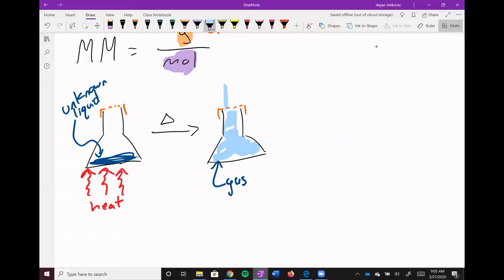And this gas at the beginning will be free to escape. Once there's a whole lot of it, it'll escape pretty quickly. But once the pressure inside of the vessel and the atmospheric pressure are approximately equal, this escaping is going to actually slow down quite a bit. And so for us, we're just going to pretend that it doesn't escape.